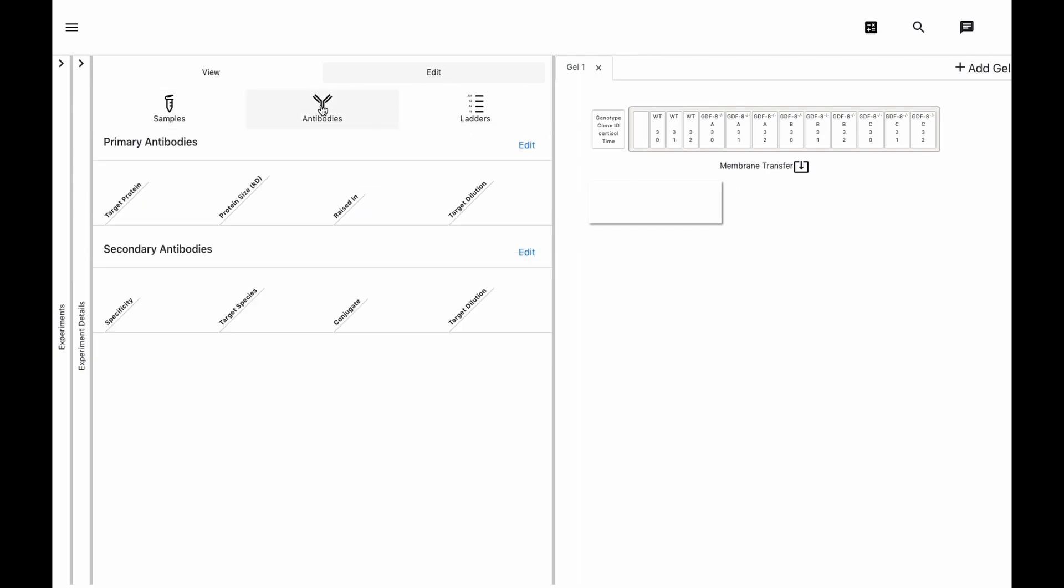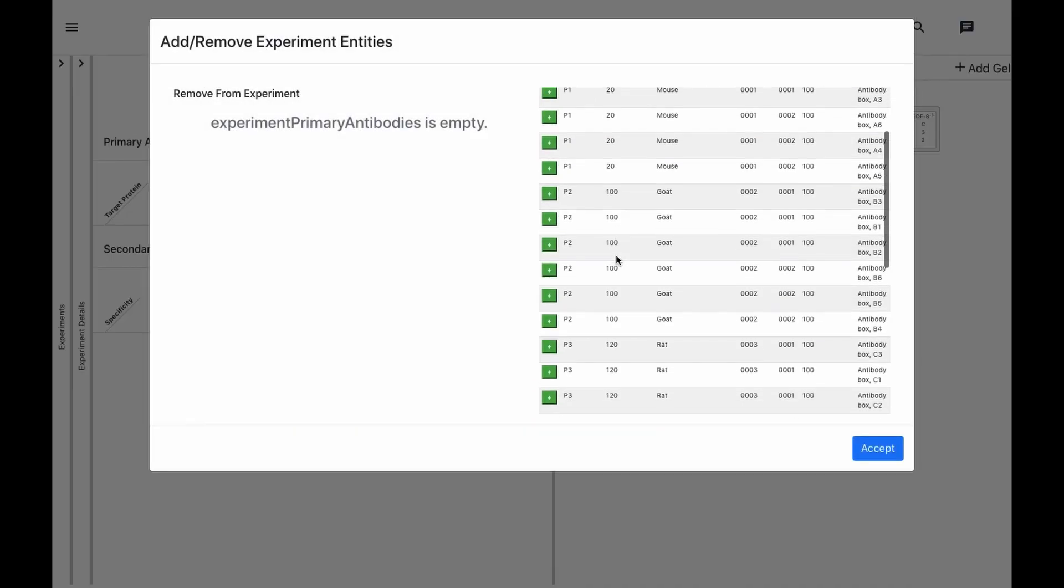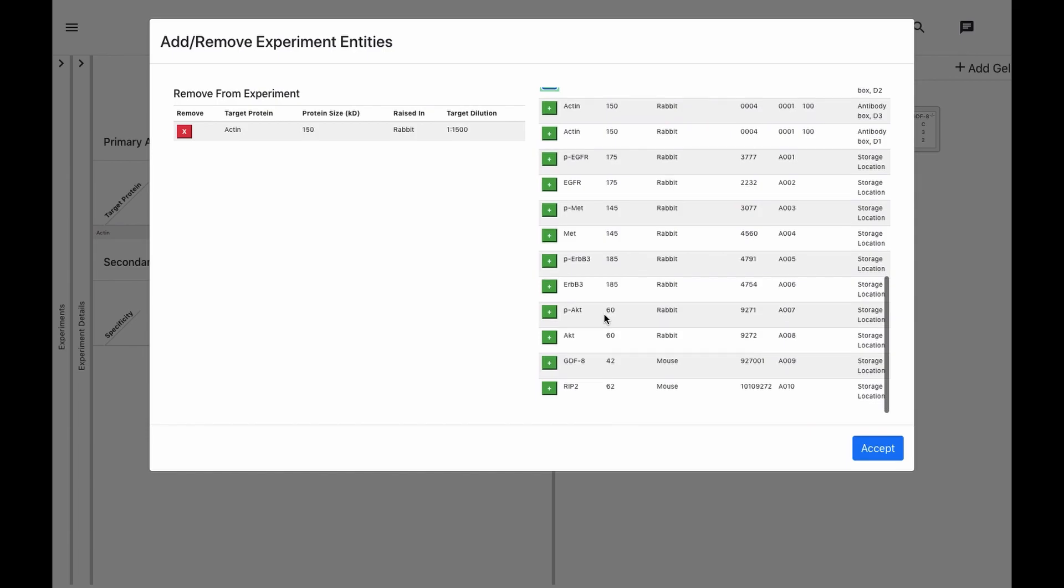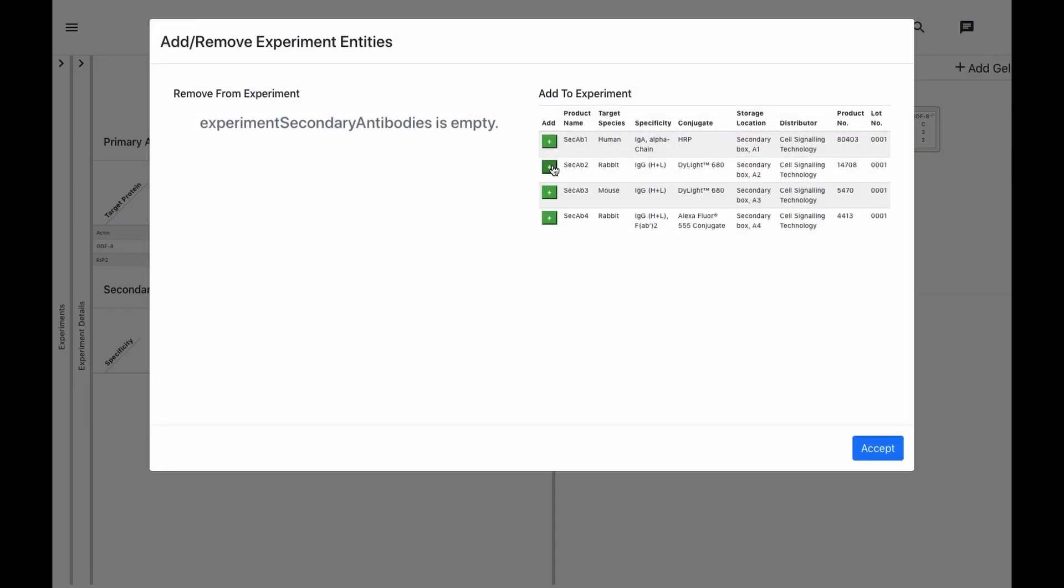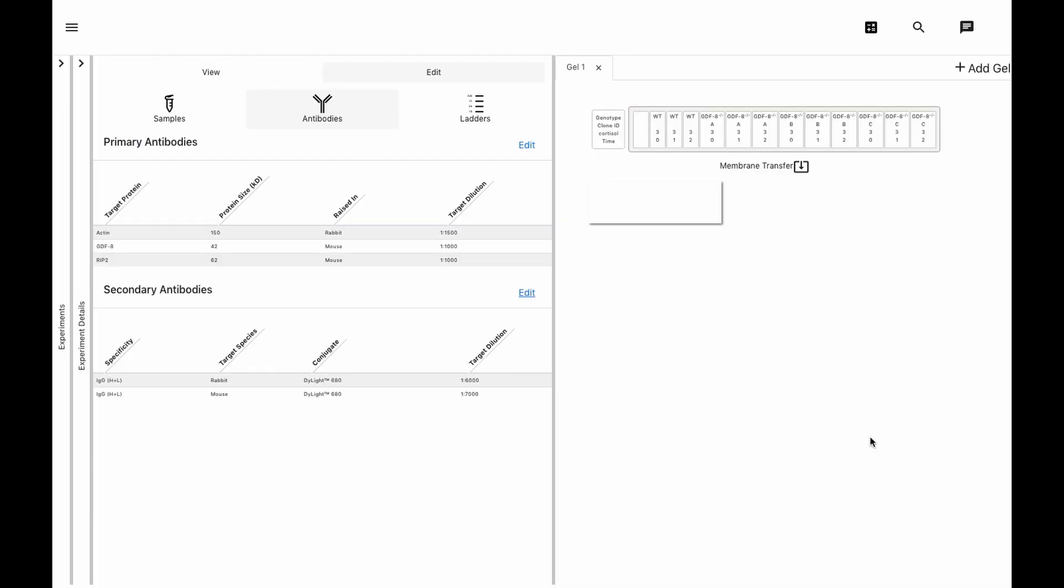Finally, we'll set up our targets by picking which antibodies we'll be using. Choose our Ctrl, GDF8, and RIP2, and corresponding anti-rabbit and anti-mouse secondaries.